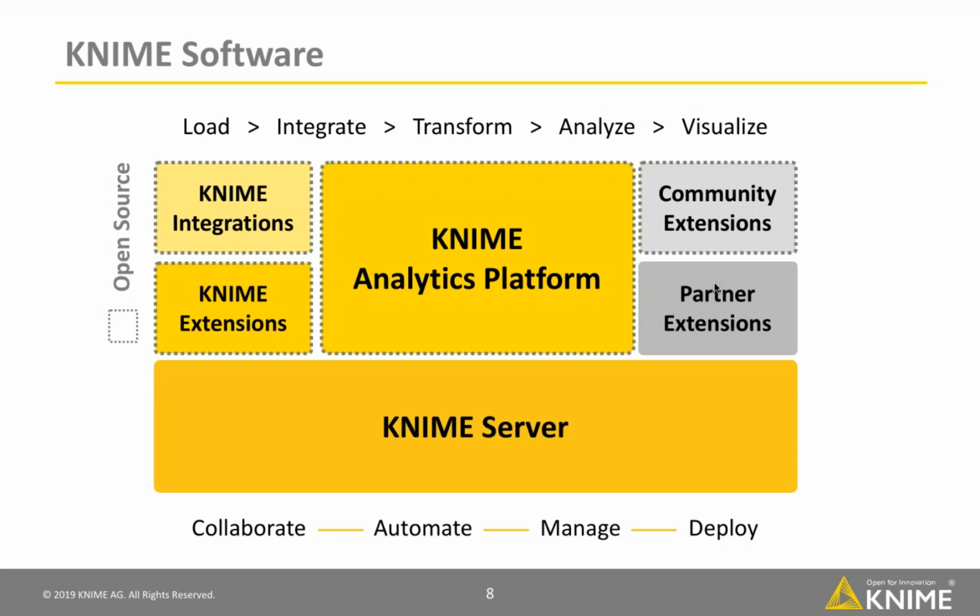What we also quite often get asked is, what is the KNIME Server? This is the enterprise solution, an enterprise software product that facilitates collaboration, automation, managing, and deploying of workflows.